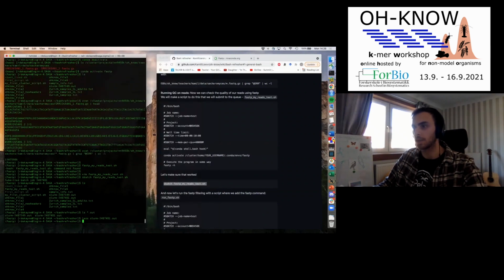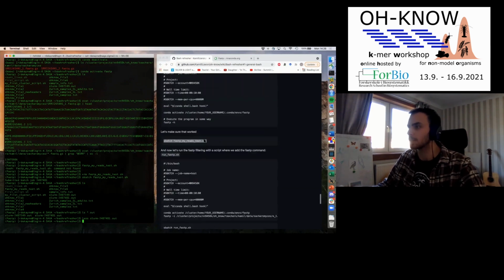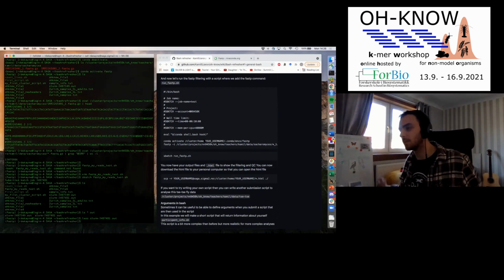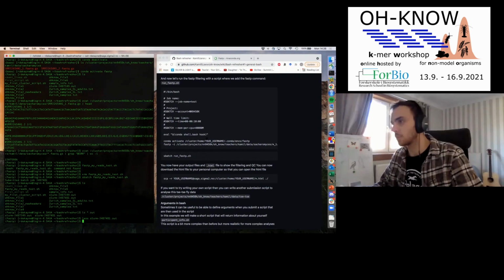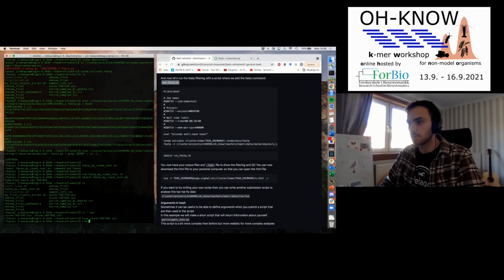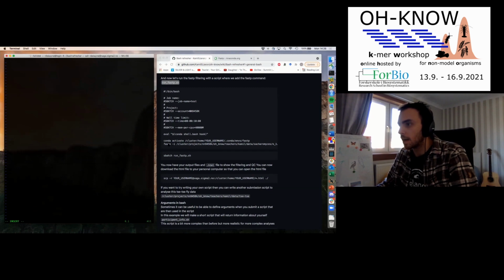And now we can go on to actually run the proper run that we want to use. It's always a good idea to test scripts before you go and run, I don't know, alignment of hundreds and hundreds of genomes, or mapping and stuff like that. Always test your stuff. So in this case, we're going to make this new script, which is going to actually have the run in. Our fastp command is using fastp -i.